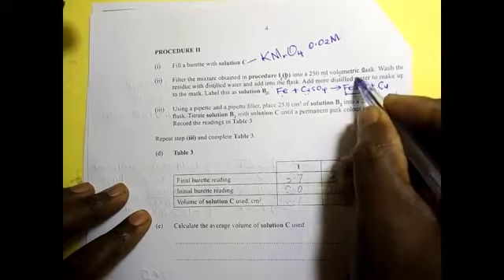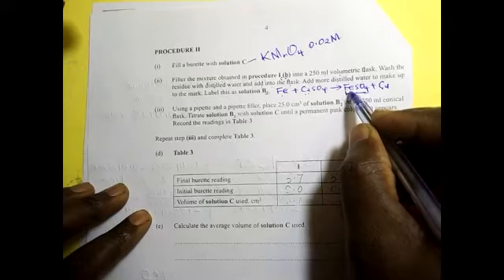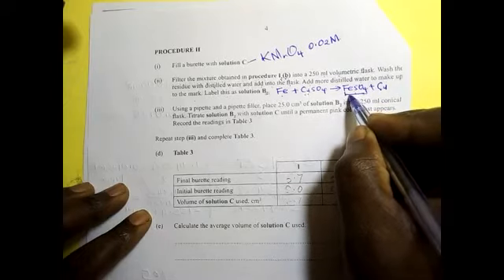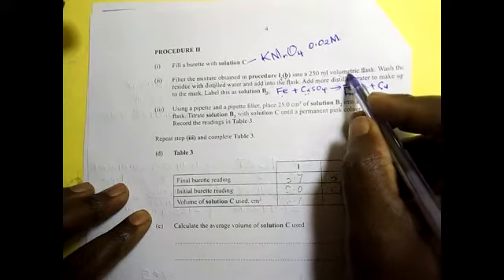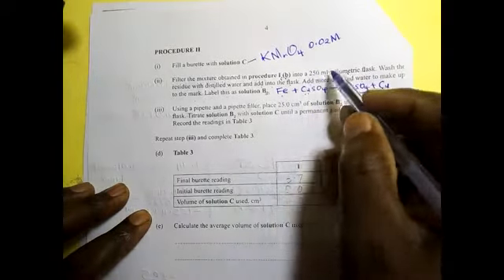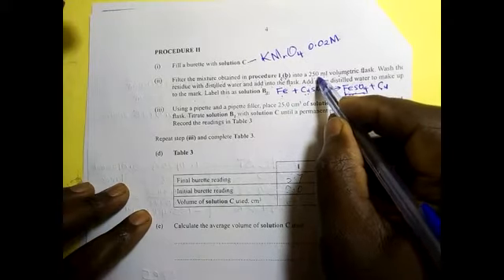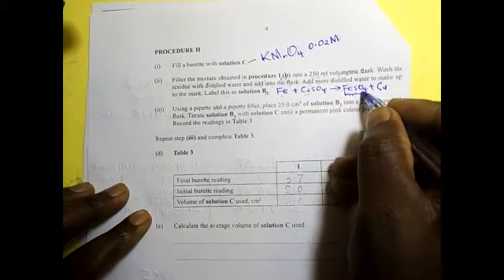So now we have filtered this solution, iron 2 sulfate. Now we are putting this solution into a volumetric flask and then add distilled water to the mark, where we will have a total volume of 250 centimeters cube of iron 2 sulfate.